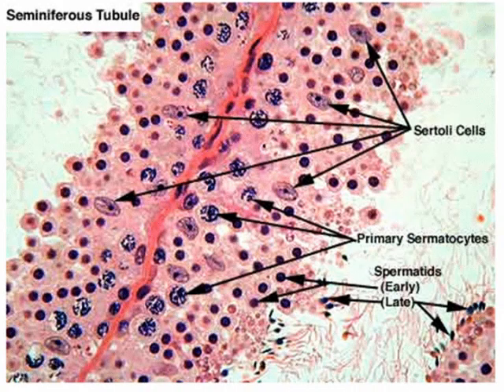Okay, this next slide is the last one in this little series. And again, I got this one from a Google image, got everything labeled. Again, you do not have to label these individual cells for lab. You do need to know when you look at these slides that you're looking at seminiferous tubules from the testis, and you need to know what process occurs there. And that process would be spermatogenesis. Okay, so that will be good for this series.